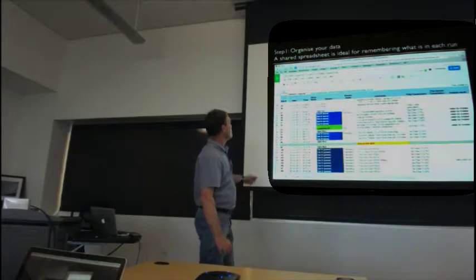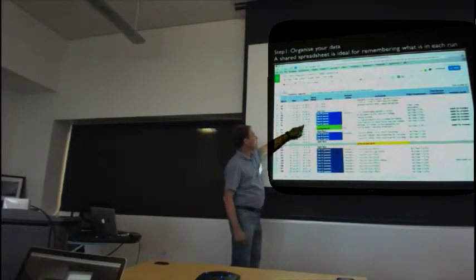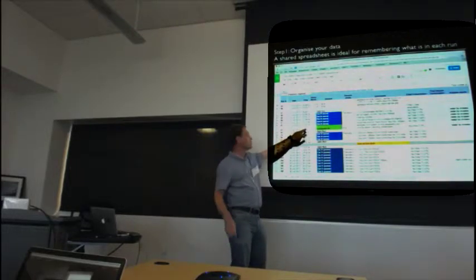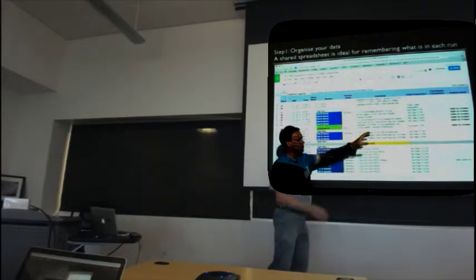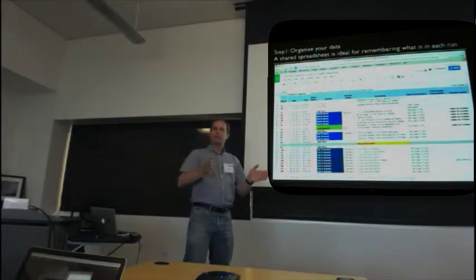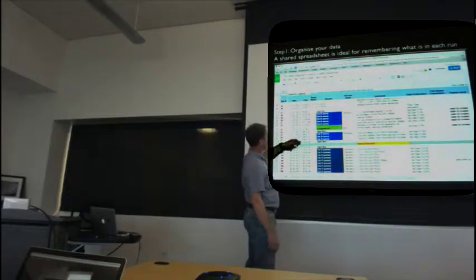To save yourself drowning in data, create a Google spreadsheet. Nadia's got some for these experiments. Basically, for this experiment, run number, when was it, so you can always look up someone else's notebook, if you've got a manual notebook or something like that. What was in it, who owns the sample, comments, what was the beamline transmission, this, that, and the other. You just, in practical terms, chunk your data into runs whenever your experimental conditions change.